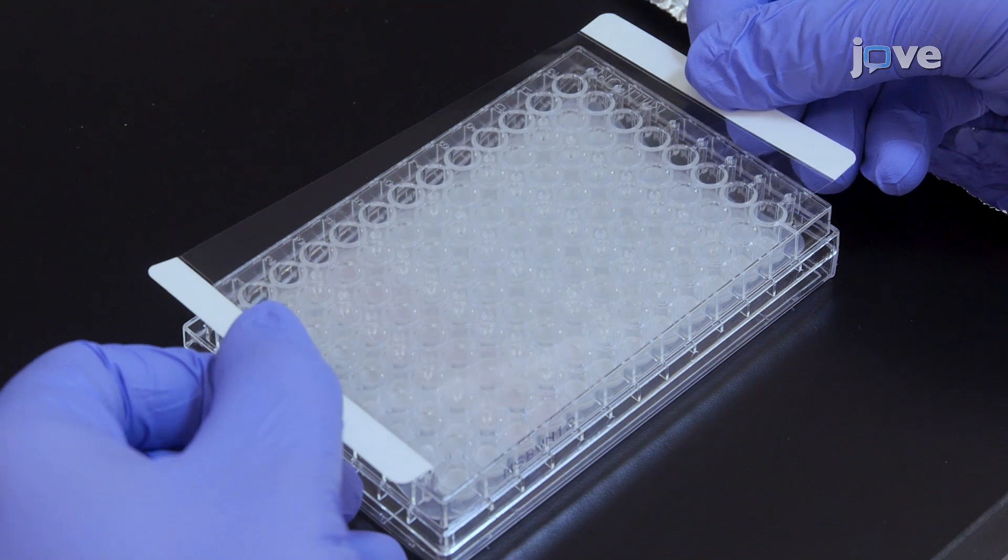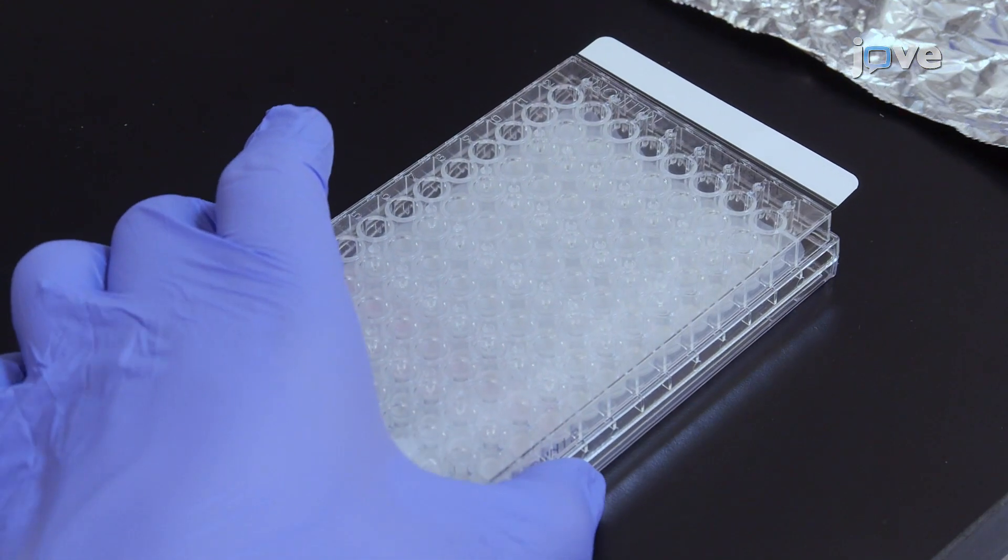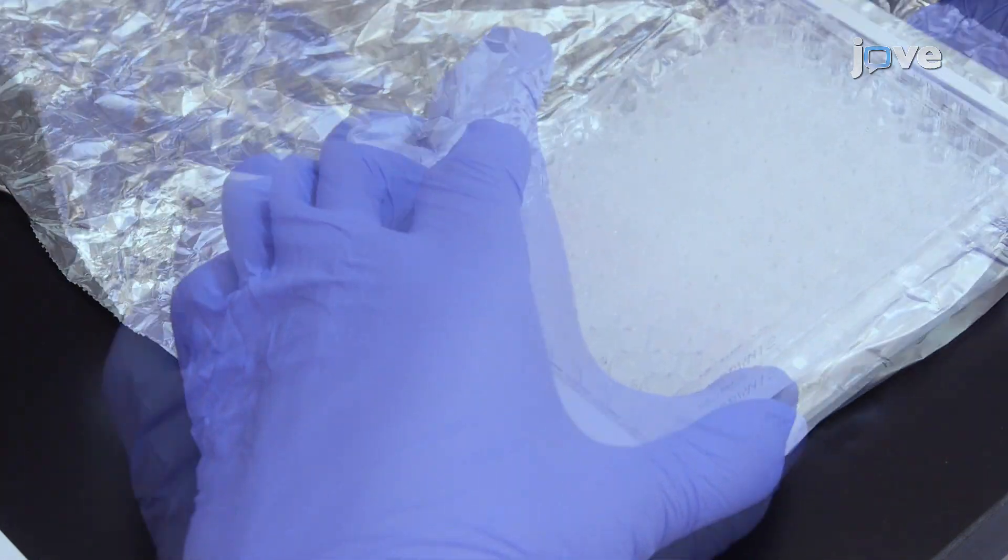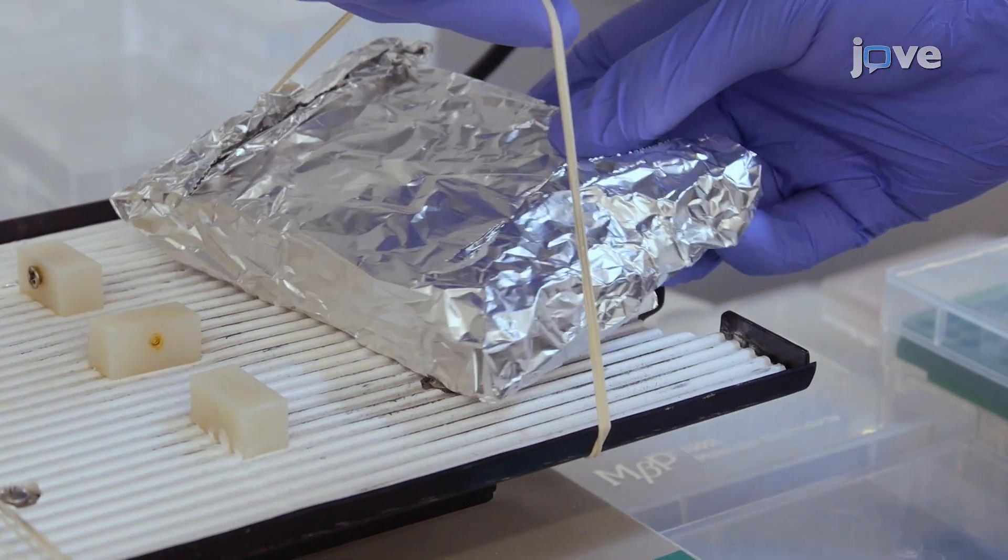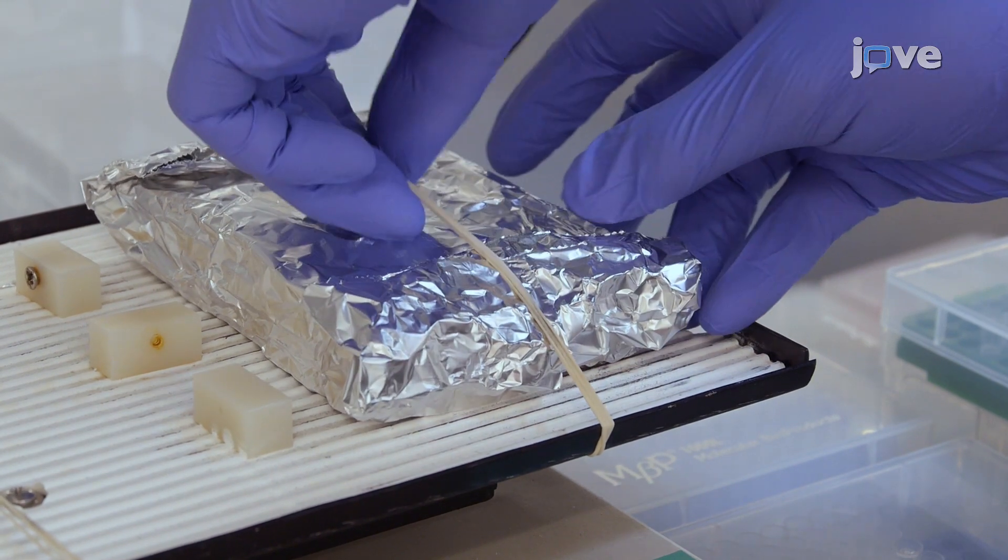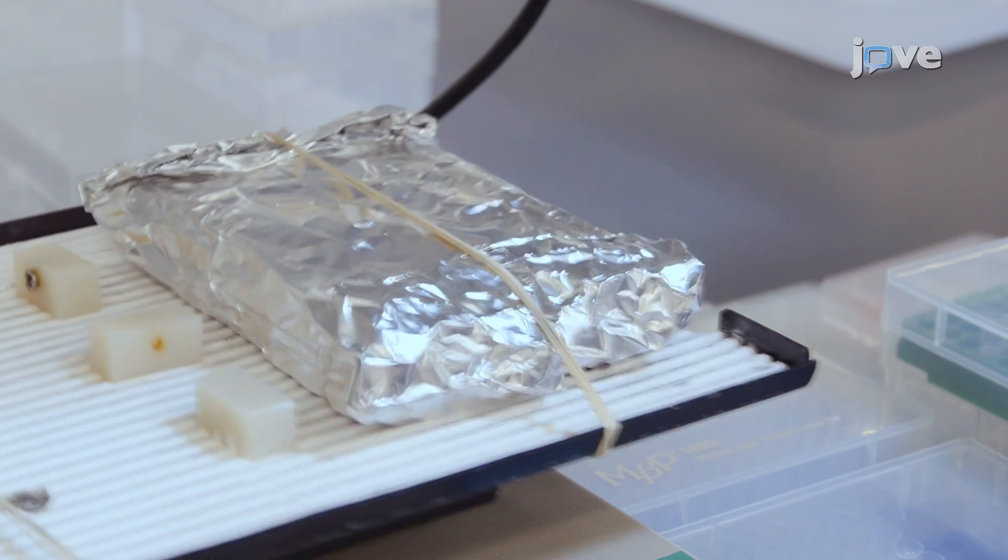Seal the plate with the plate sealer. Once sealed, wrap the entire plate, including the inverted plate cover, with aluminum foil. Place the plate on a plate shaker, secure it, and shake at approximately 500 RPM for 2 hours at room temperature.